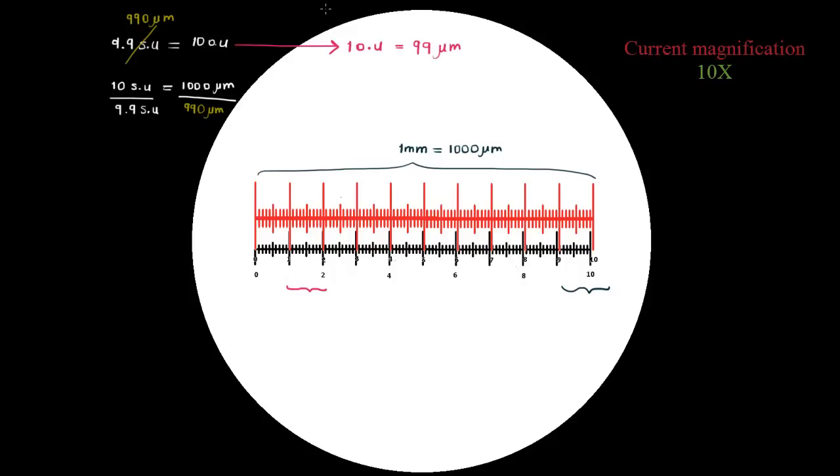And there, we've calibrated our microscope on the 10x magnification. This is something you would want to write down in your lab notebook if you have one, or somewhere else, to refer to in the future if you need to use the same microscope under the same magnification later on.